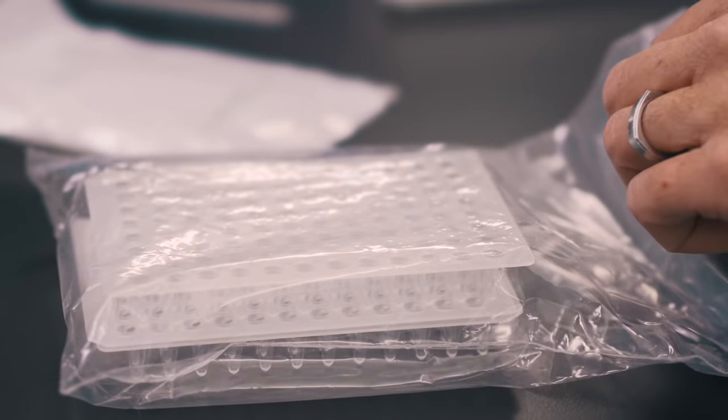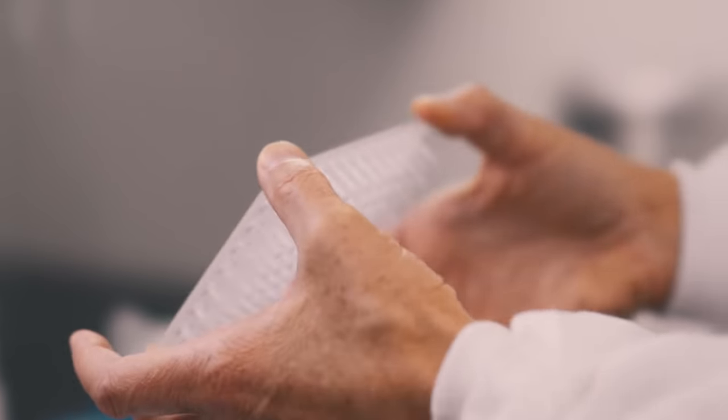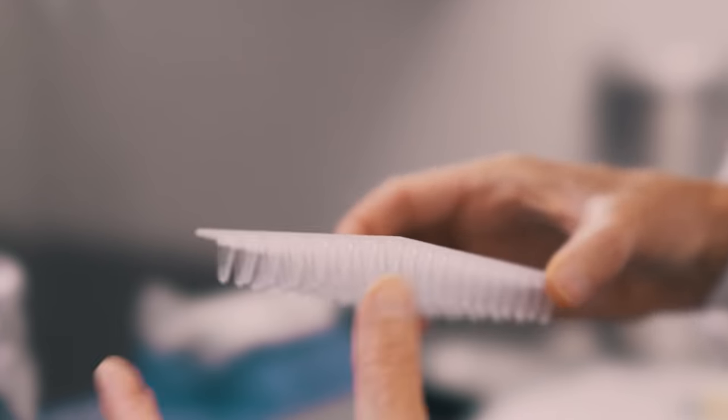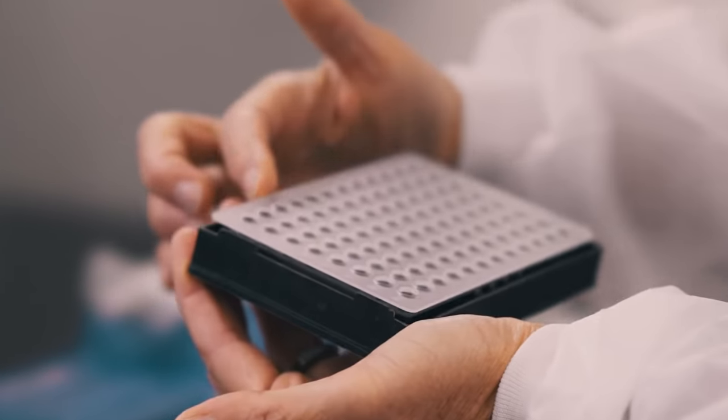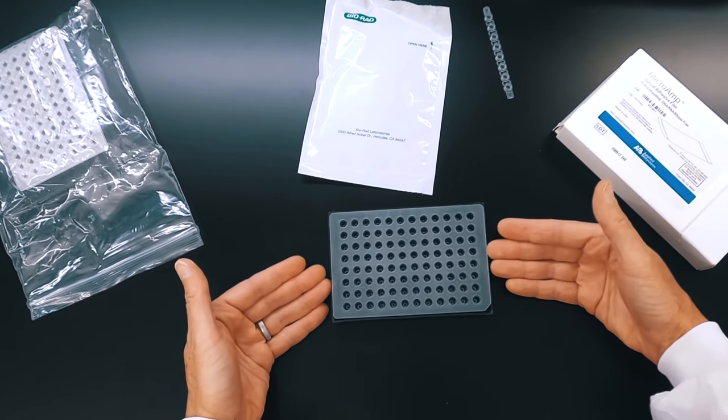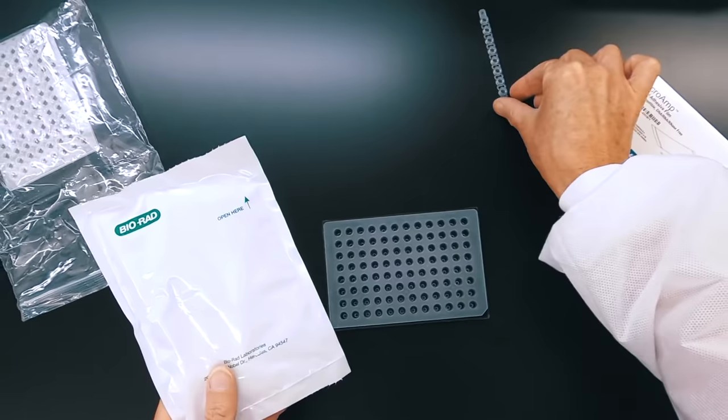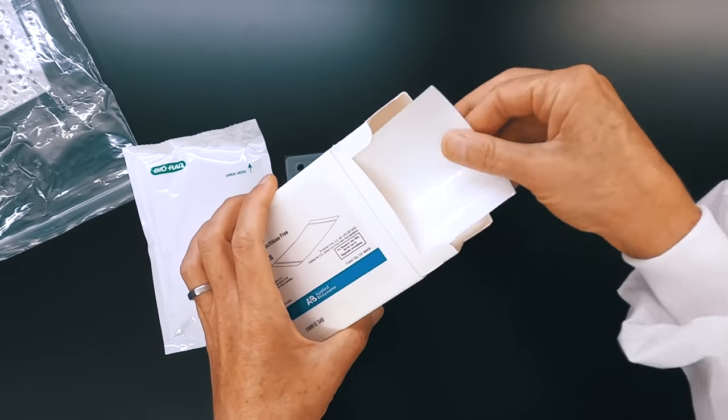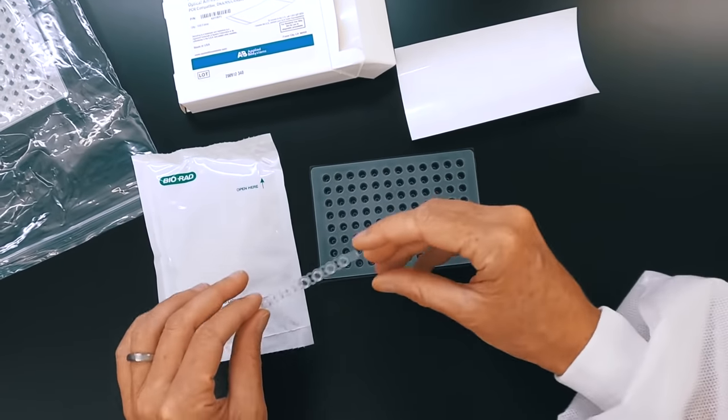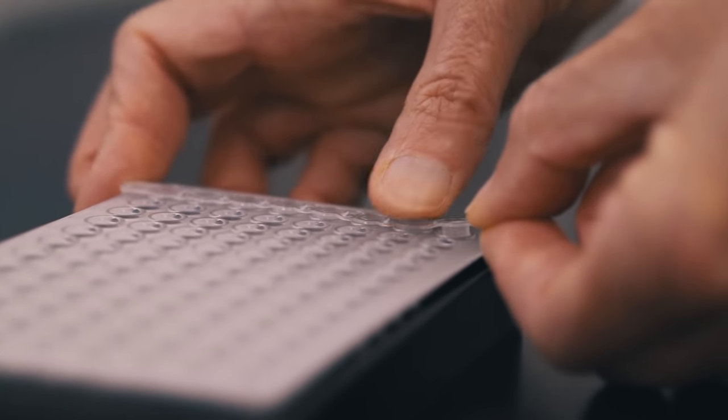Next, I want to talk about some of the specialized real-time PCR equipment that we're going to use. The reactions are set up in 96 well plates that hold about 100 microliters each. And it's helpful to have a rack to put them in. The plates are labeled A through H and 1 through 12. After your reaction is in them, you can seal them a couple of different ways. You can seal them with either optical caps like these or optical tape like this. The optical caps will snap down and create a very nice seal.